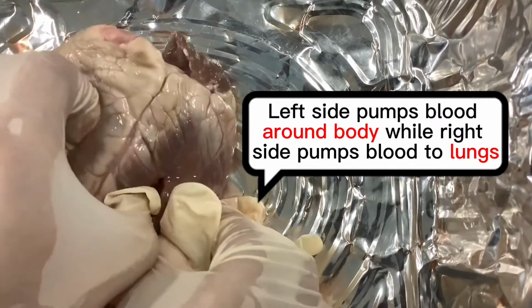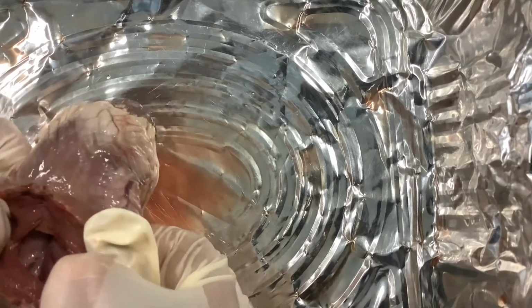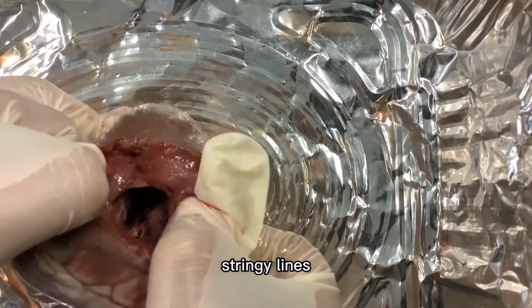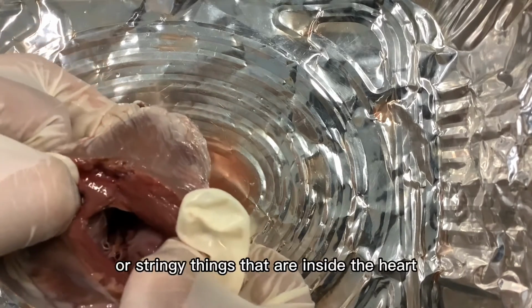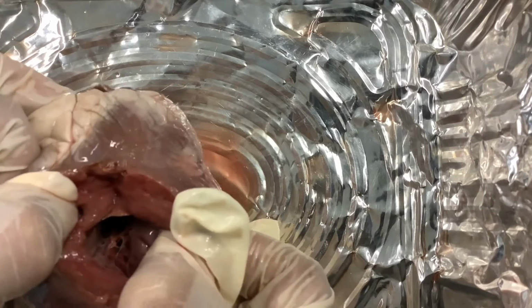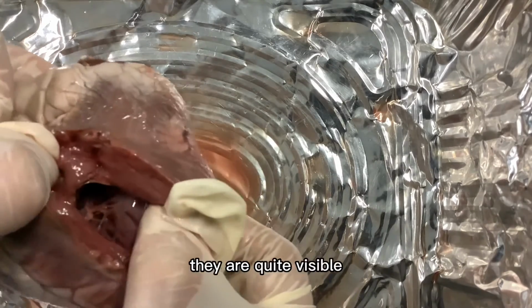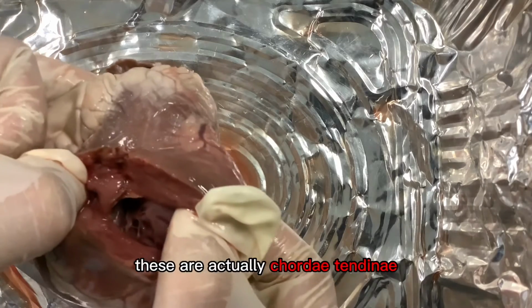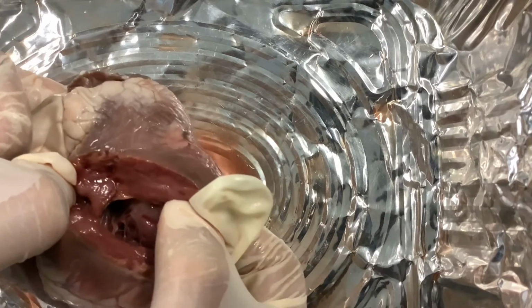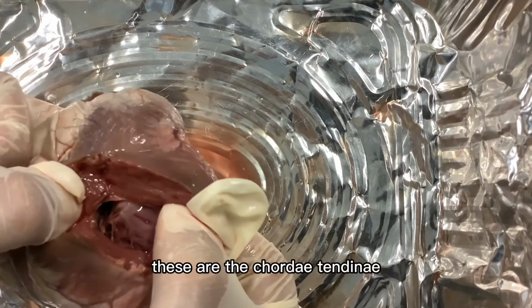Alright? Alright, one more thing that we might also want to take a look at is that if you open up the heart a bit more, you might notice some of these stringy lines or stringy things that are inside the heart. Okay, so this is technically not covered in the science biology syllabus, but because they are quite visible, these are actually chordae tendineae. Okay, and these are structures that help with the opening and closing of the valve. So these stringy structures here, these are the chordae tendineae.